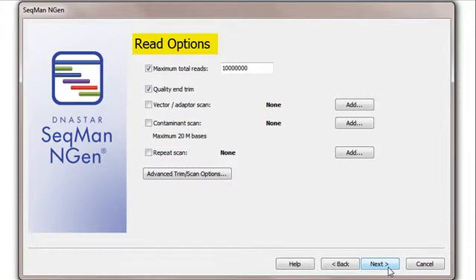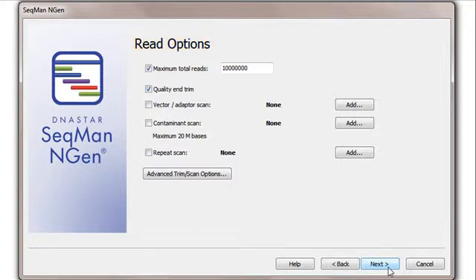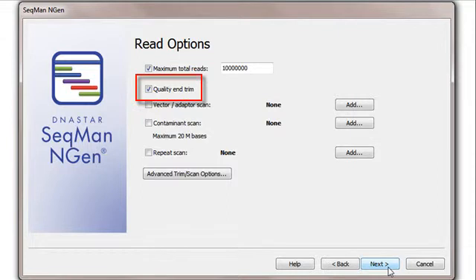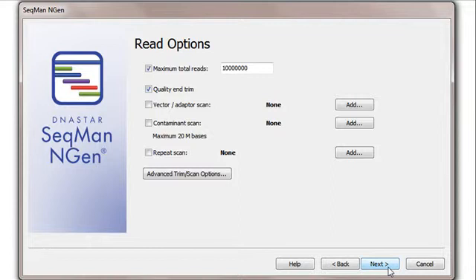The next screen, entitled Read Options, allows me to choose options for trimming my data of all contaminating linkers, primers, repeats, and vectors. By default, SeqMan NGen uses quality scores to trim low-quality data. The only thing I'm going to change here is to add a vector scan to remove the SMART linkers from my data.